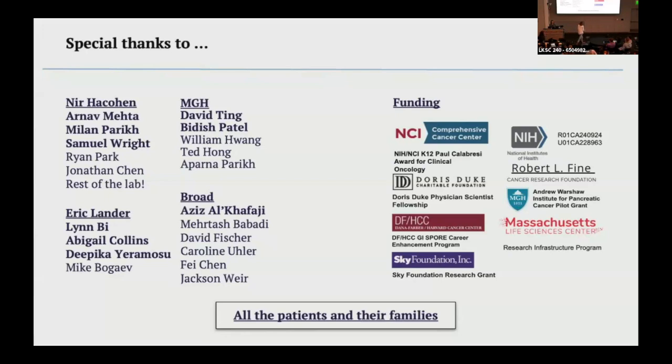Okay, great talk. Two questions from Zoom. The first one, I think you mentioned in the last bit when you were talking about future directions: can this model be applied to Visium spatial transcriptomics data, especially the more recent Visium HD data? We have not tried to. I think with the number of genes in Visium, the runtime would not necessarily be conducive, but it is definitely something that we can look into adapting for.